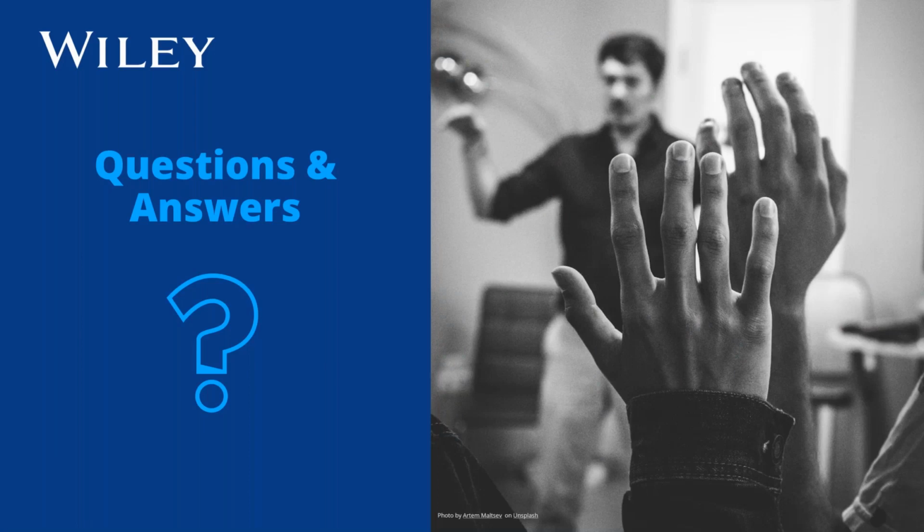Okay, here's another good question. Is the software 21 CFR 11 compliant and/or does it meet the requirements of ISO 17025 for the integrity of records? It's complicated to answer that question.